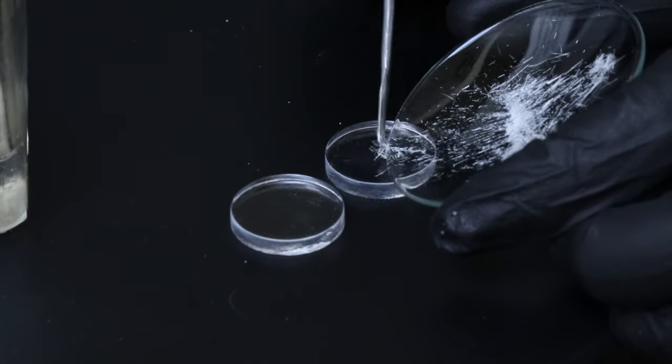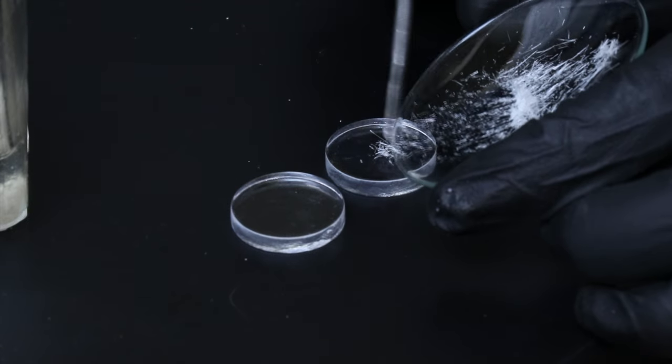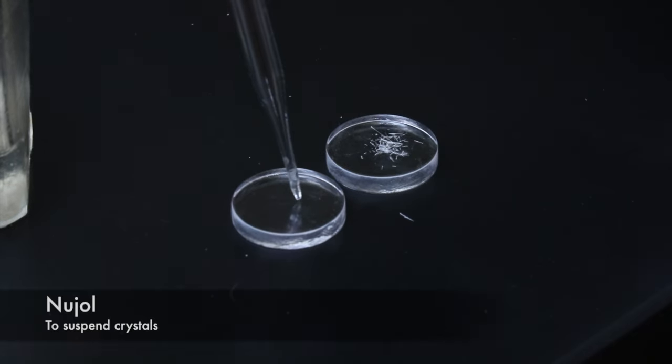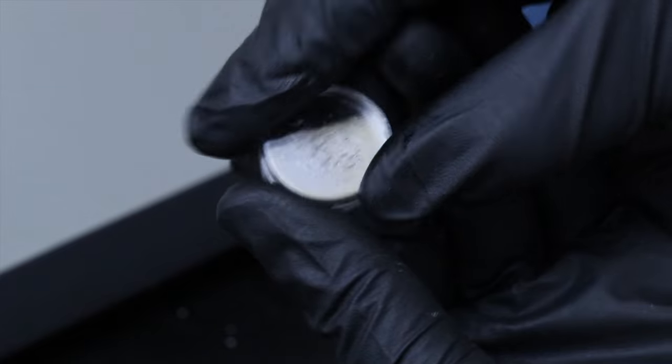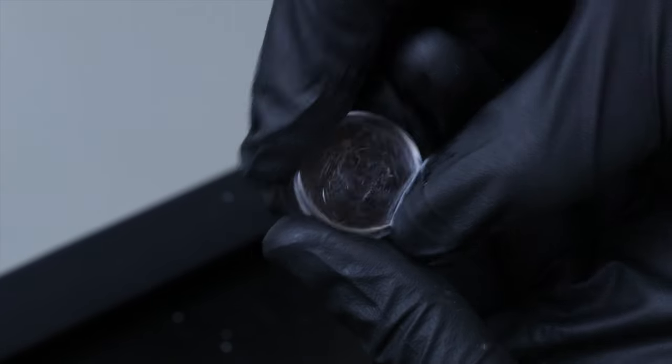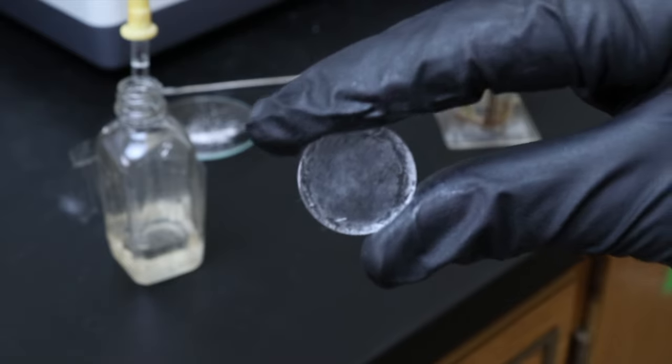I'll run an IR spec using the Nujol mull technique. So I'll add some of the crystals and then add some Nujol. And then I'm going to mull the salt plates together until more of a film is what's left in between them.